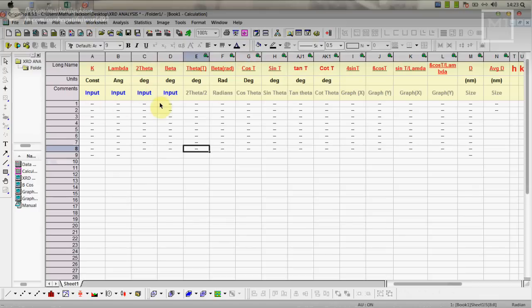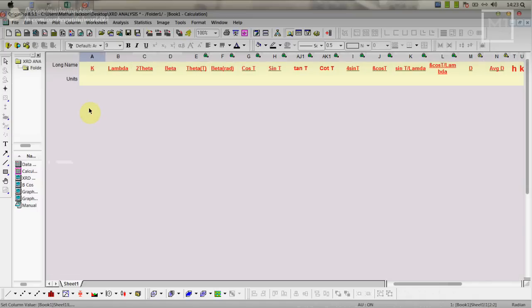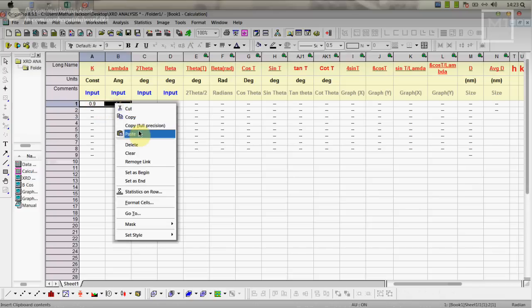Let's move on. Now we are going to give inputs. Basically constant is 0.9 and lambda is 1.5. Now we just copy this and paste over here.